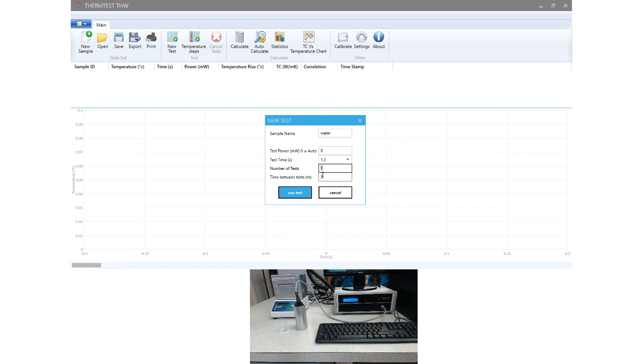In addition, inside the software, we can control this thermoelectric dry bath from a range of 0 to 100 degrees to automate thermal conductivity measurements with temperature. So let's go ahead and make one measurement. This sample we're measuring in this demonstration is actually water. Typical test times for measuring liquids are on the order of around 1 second.